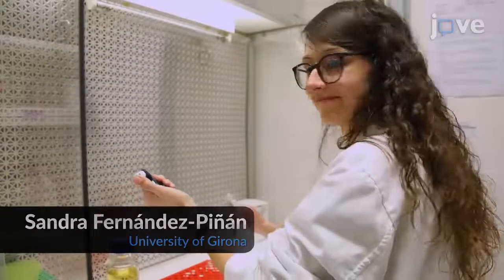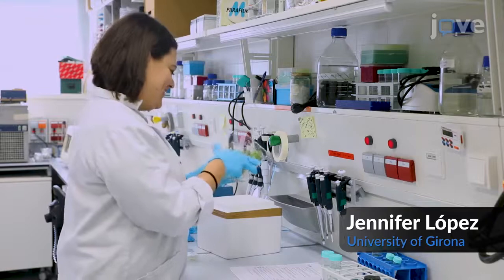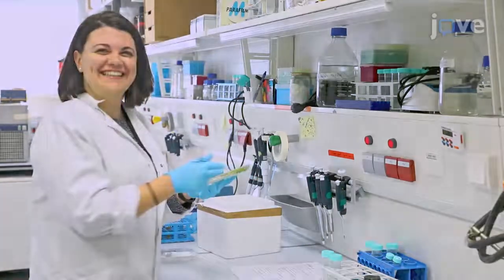Demonstrating this procedure will be Sandra Fernandez-Piñan, a postdoc, and Jennifer Lopez, a master's student from our lab.